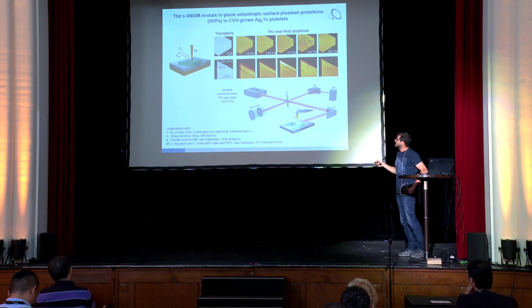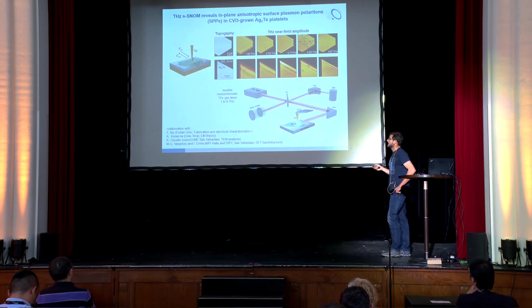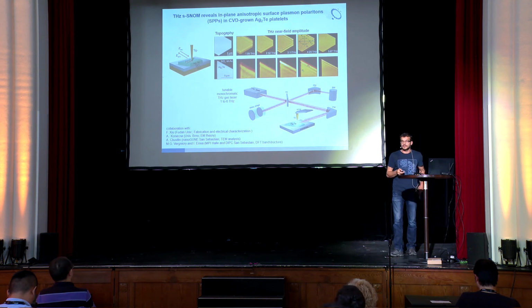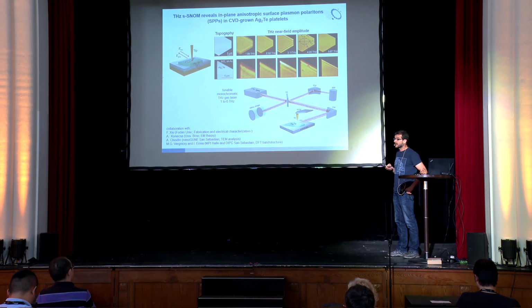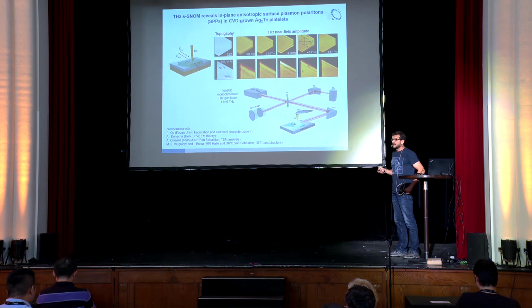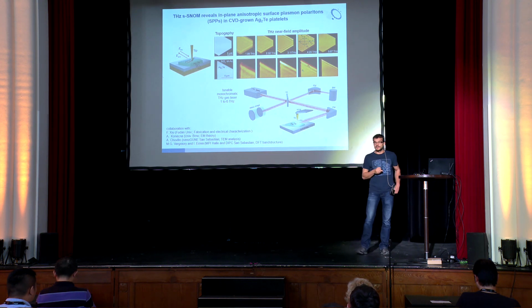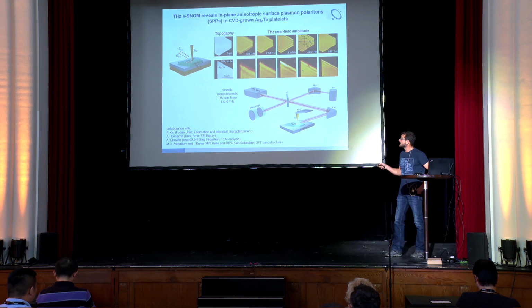Maybe before I continue, let me say one word to the setup. So the setup is a monochromatic imaging setup. So it's based on a NeaSPEC setup, of course. But then we use a gas laser, actually. We don't use TDS. So this is a CO2 laser that pumps some gases, and then we get terahertz radiation.